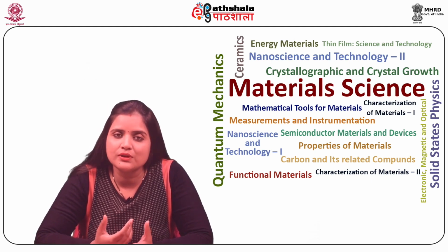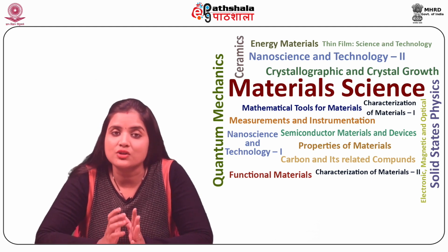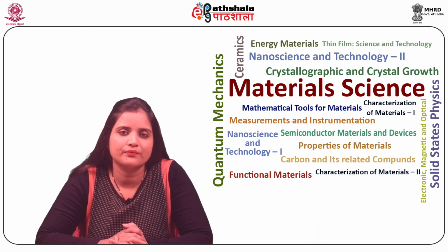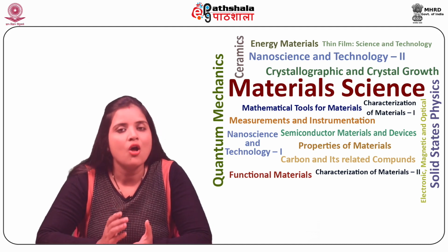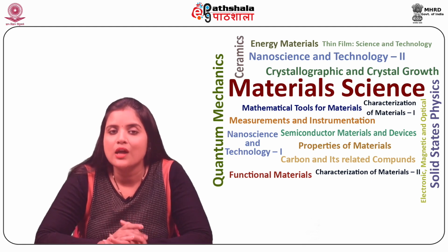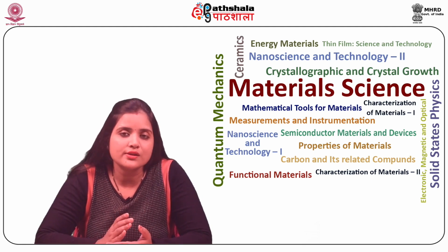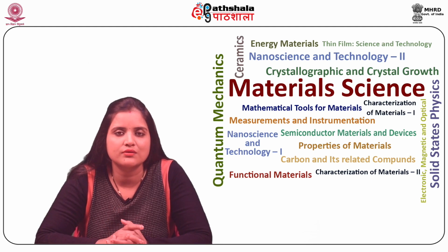Contrast. It is possible to take advantage of the various contrast techniques that are available to optical microscopy through SNOM, but with much higher resolution. By using the change in the polarization of light or the intensity of the light as a function of the incident wavelength, it is possible to make use of contrast enhancing techniques such as staining, fluorescence, phase contrast, and differential interference contrast.